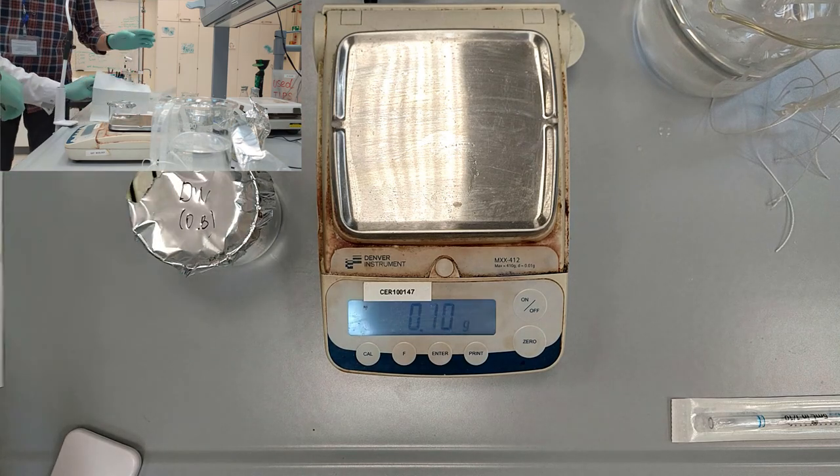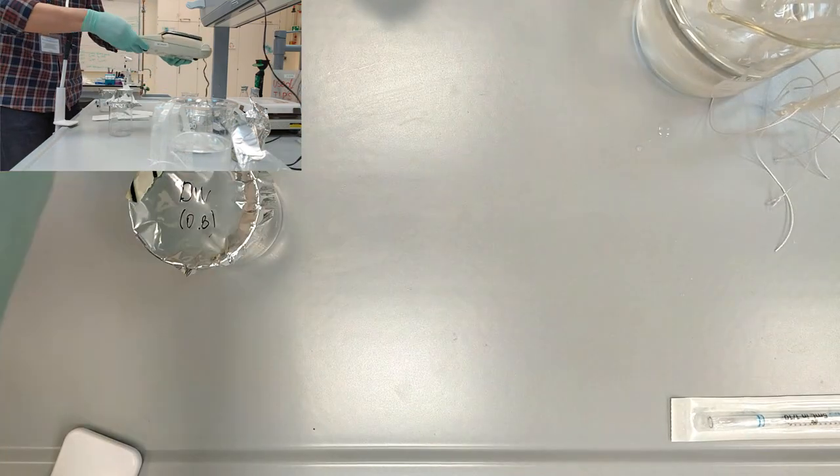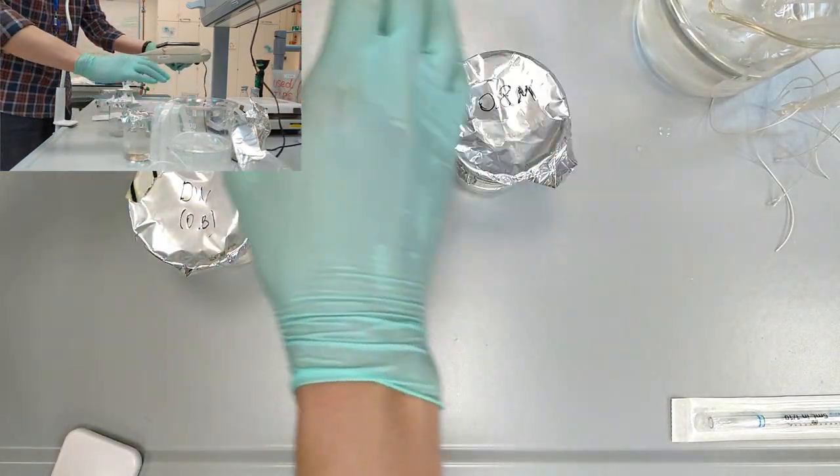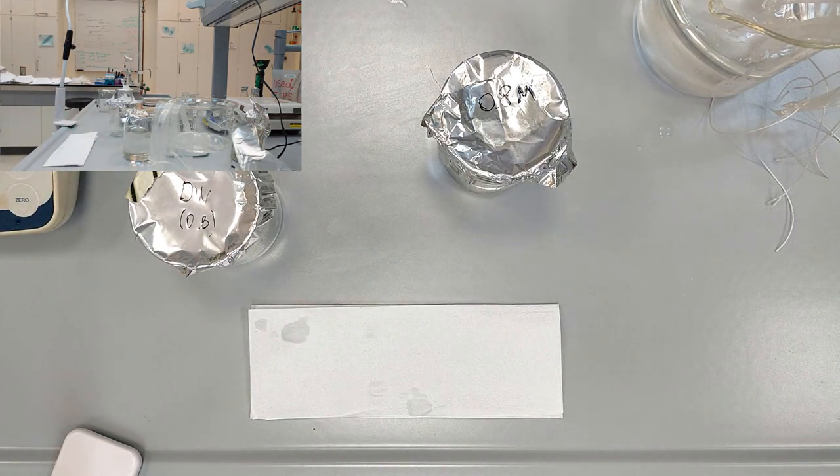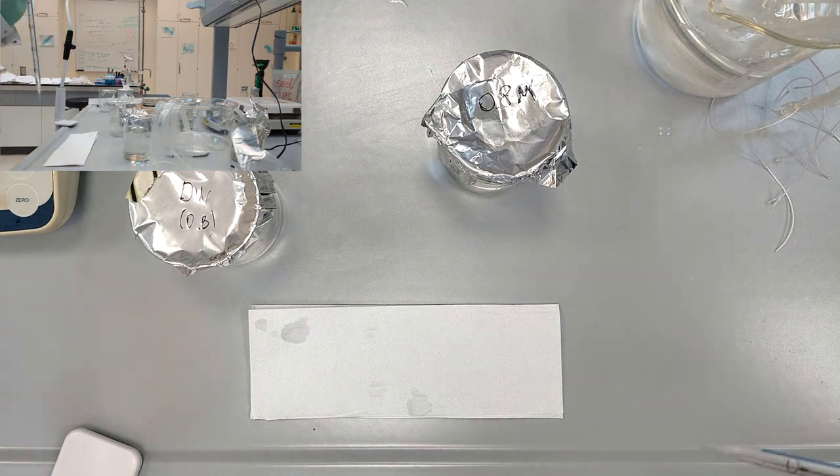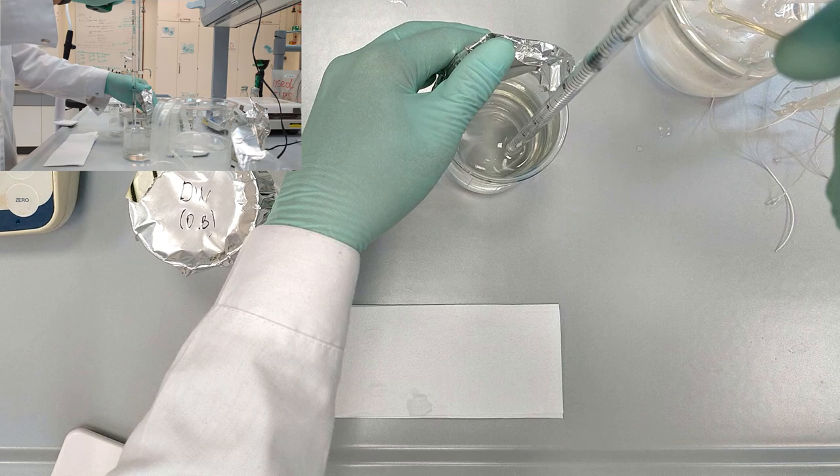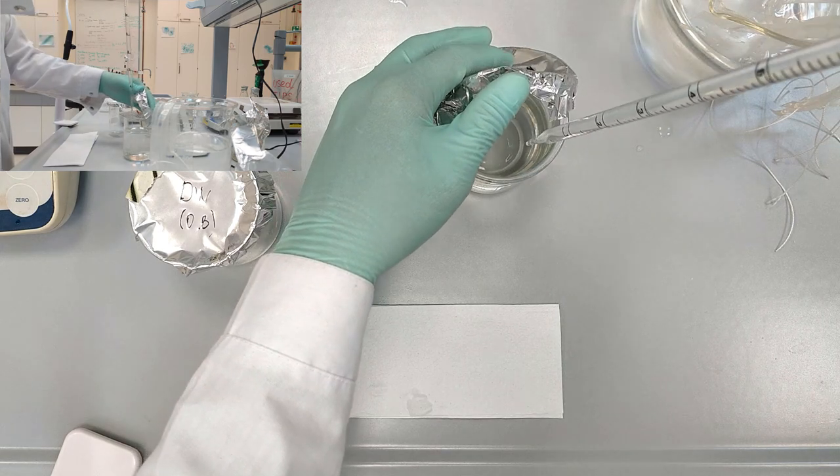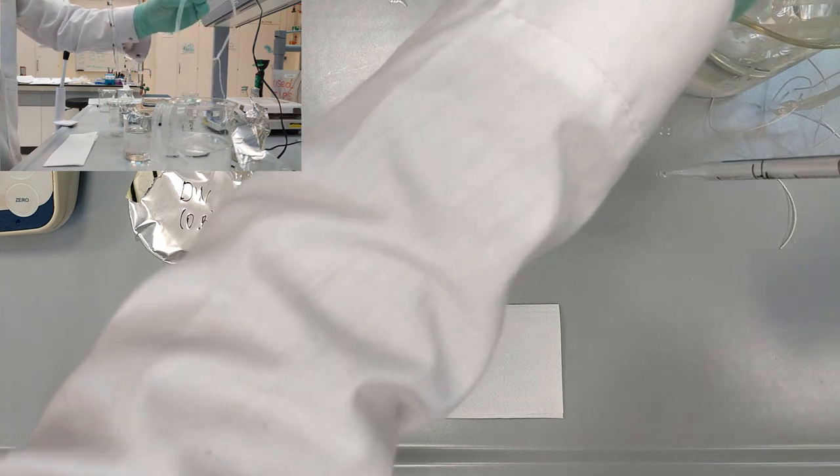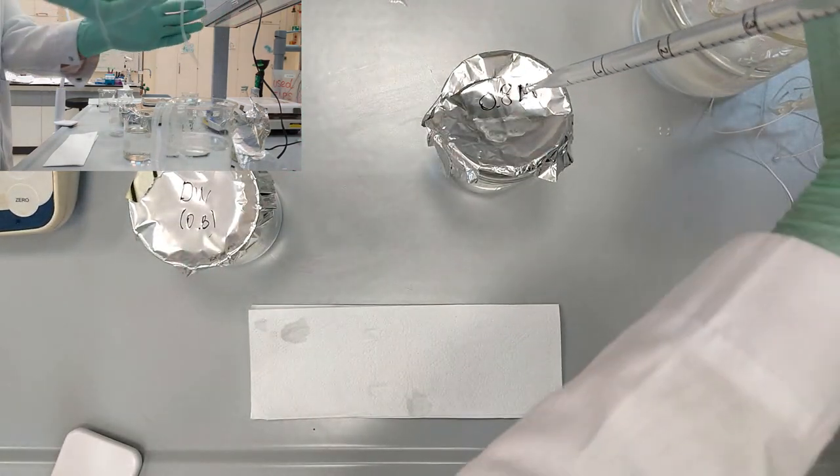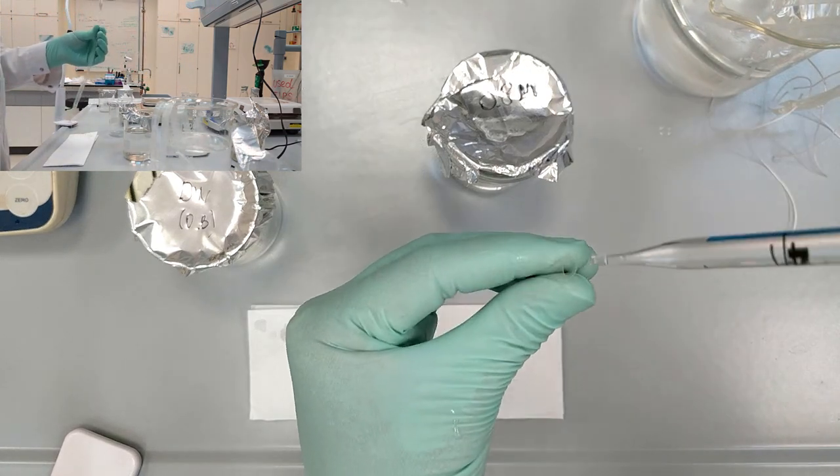The same preparation of the dialysis tube will go for 0.8 and 0.4 mols per liter concentrations. Pipet up the appropriate volume of the solution, take the dialysis tube, open the open edge of it and then transfer this solution inside.